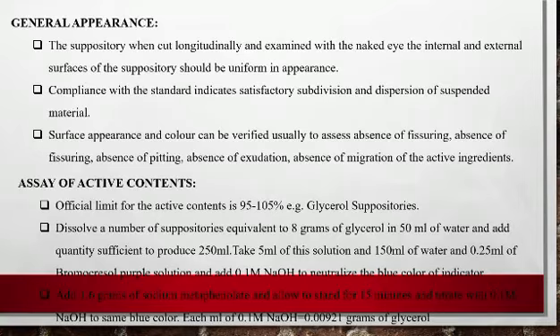Next is general appearance. We check the quality of the suppositories by looking at their outer appearance. When the suppositories are cut longitudinally and examined with the naked eye, the internal and external surfaces should be uniform in appearance.